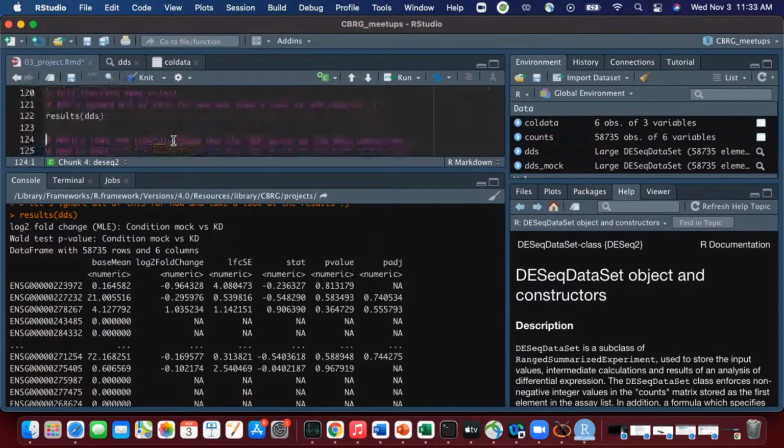So that's really it from start to finish. If you have this unnormalized count data, you want to get fold changes and statistics, it's just like 2 or 3 lines. I'm going to pause here. Are there any questions about any of this?